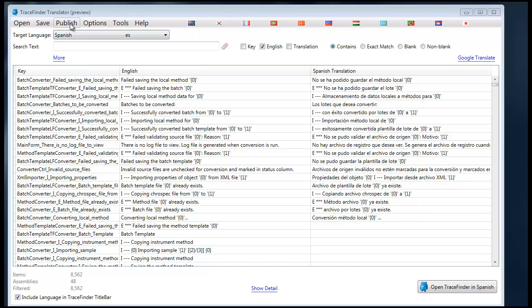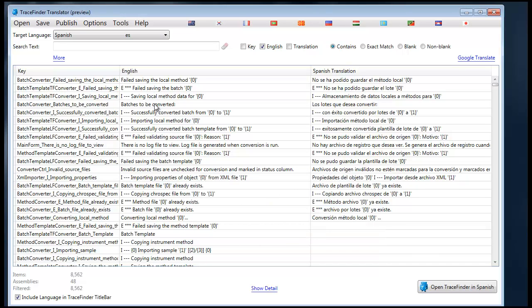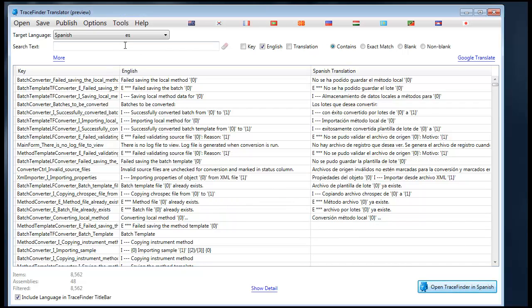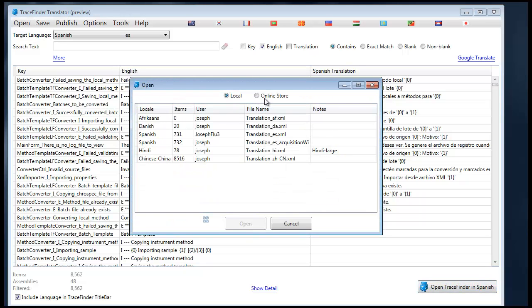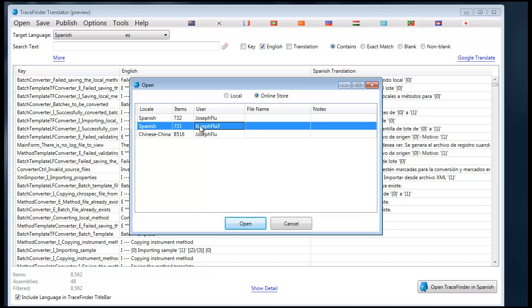You have the publish option, which I'll come back to, but this basically allows you to publish to the online store to be made available for other users to download. You'll see once you publish a file, it will be available in the online store according to the locale and user name that you've uploaded it as.